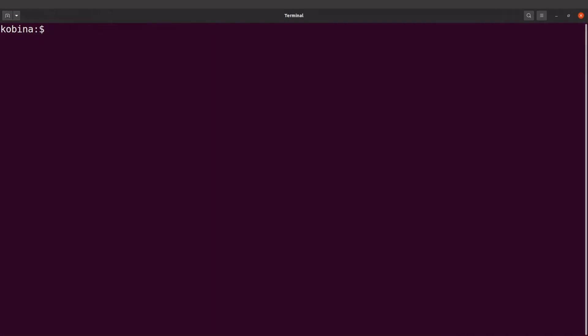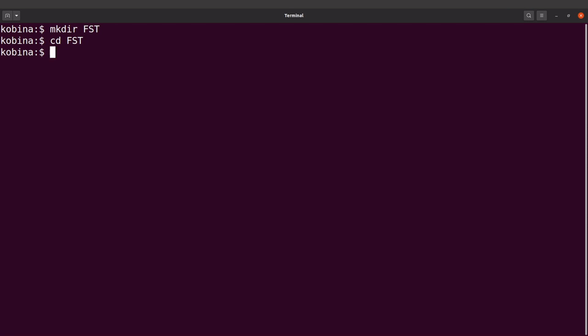Okay, I am in the terminal now. This is my command line. What I'll do first is to create a directory and then I'll cd into it. That'll be my working directory. So I'll say mkdir, let's say fst, and then I'll cd into it. Perfect. So now I'm going to download the VCF. Now for the download you can use wget or you can use curl or you can use other command line downloaders. But I'll use wget because I have that on my system. If you are using macOS you can use curl also.